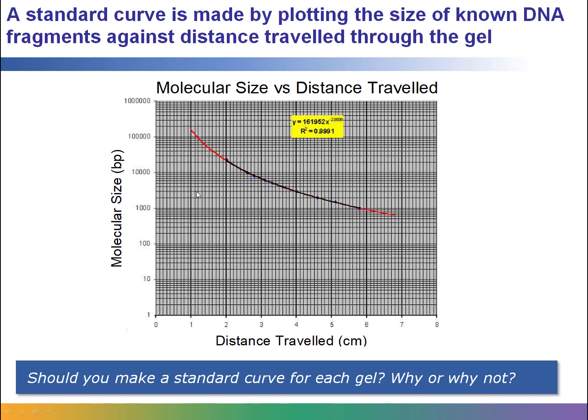The graph paper looks a little bit different because this is log paper, so we're going in base tens here. If you start at 1, you go up to 10. Each line in between represents 1, so this would be 2, 3, 4, 5, 6, and it gets really crunchy as you get up to 10. Then this next group, 10 to 100, each line represents 10. These would each represent hundreds. These would each represent thousands, and you can increase. So it allows us to put all this data on a graph that's nicely, tightly packed, or else our axes, if we had to go from 1 to 100,000, it would be huge. I couldn't give you a graph paper big enough for that.